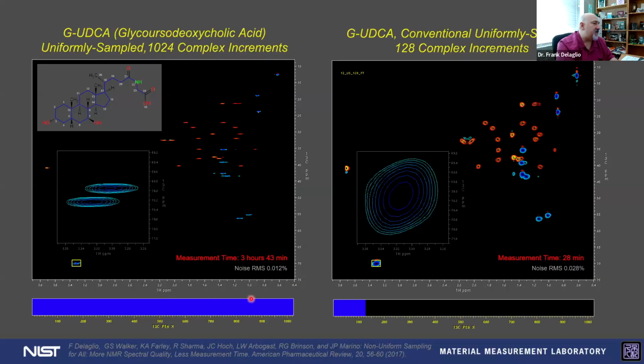So this measurement takes 4 hours. This measurement takes half an hour. In a pharmaceutical environment, this would mean that this measurement has to be postponed to a night queue. And so an analyst would not get a result until the following day, whereas a measurement that only takes half an hour could be done more or less immediately.